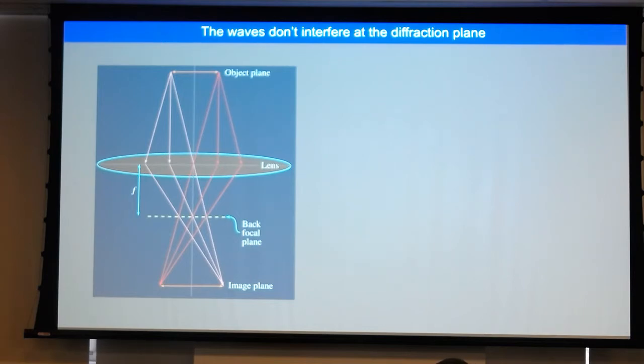So the back focal plane is a very special place where, if we just look at the intensity, it does not care at all what the focus level is. Of course, if you really screw things up, then those spots become out of focus. But if you just imagine parallel illumination and we move the specimen up and down, nothing is going to happen in the diffraction plane that we can see if we're just looking at the intensity.